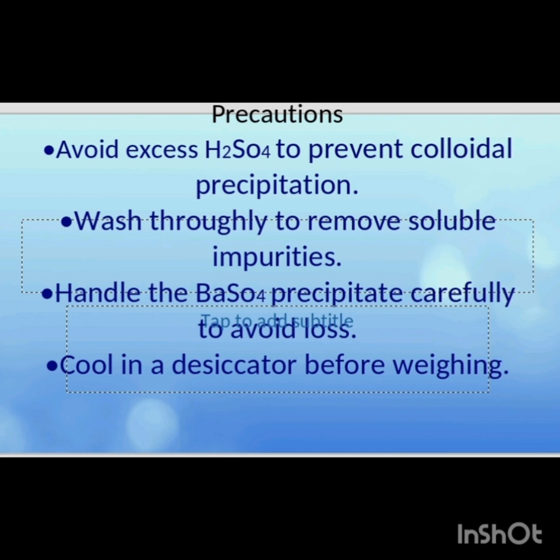Precautions. First one, avoid excess H2SO4 to prevent colloidal precipitation. Second one, wash thoroughly to remove soluble impurities. Third one, handle the barium sulfate precipitate carefully to avoid loss. And fourth one, cool in the desiccator before weighing.